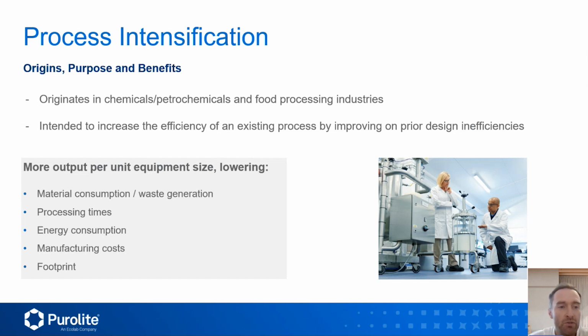This can manifest in a range of ways, from single-use items to pre-packed chromatography columns, as well as more advanced strategies such as continuous chromatography and process analytical technology.